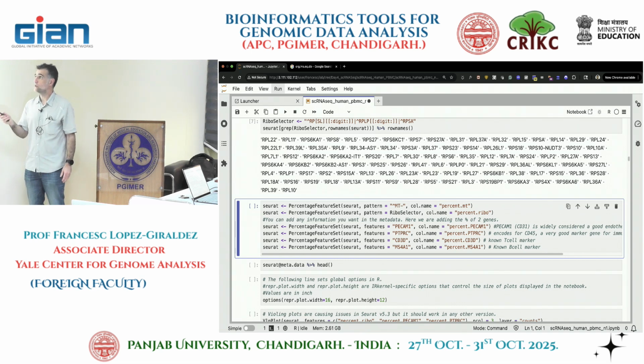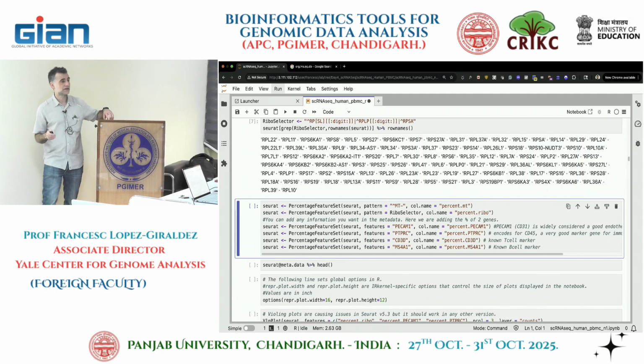And it detected all of those. Those are ribosomal proteins. The problem is, if the cell is busy doing transcription, you're going to have a lot of these being expressed. Maybe they are not important for your biology, and you want to downplay them or remove them from the clustering process. It's one of those noises we talked about earlier.